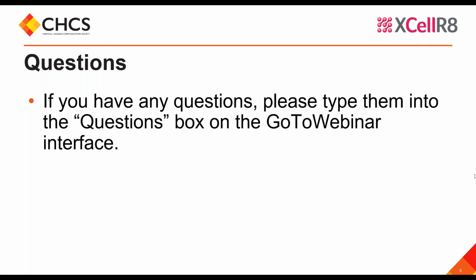Well, it depends what you want to use the data for. If you need the data for a regulatory submission, it's essential that the tests are performed to good laboratory practice, so you would definitely need a GLP accredited lab for that. If you're performing the test for just new product development purposes for your own information, then it isn't essential, but it would still be recommended in terms of getting the best quality data.